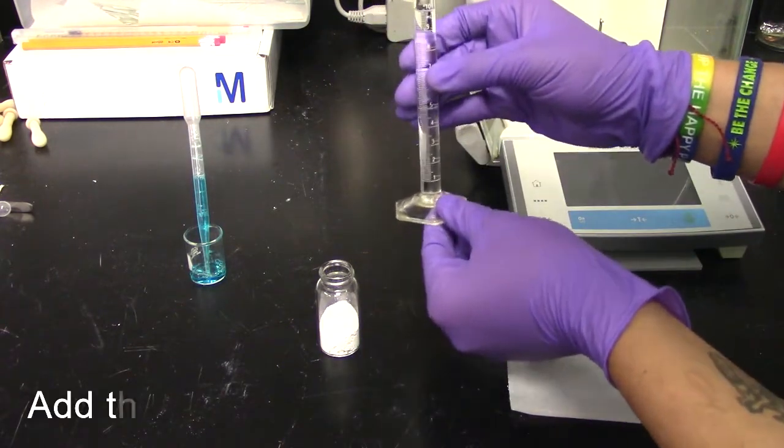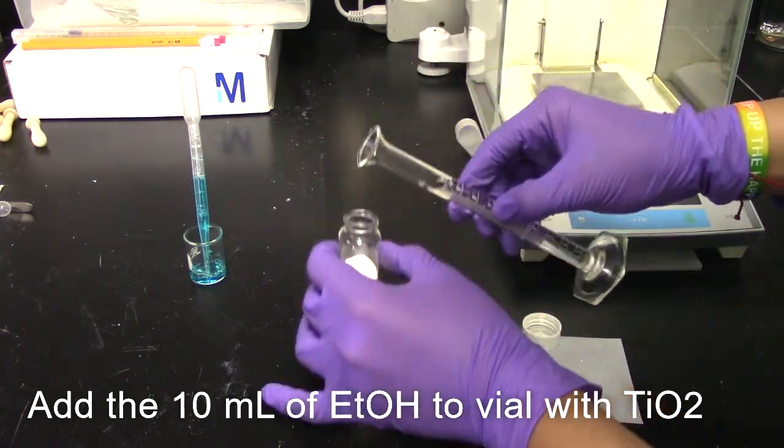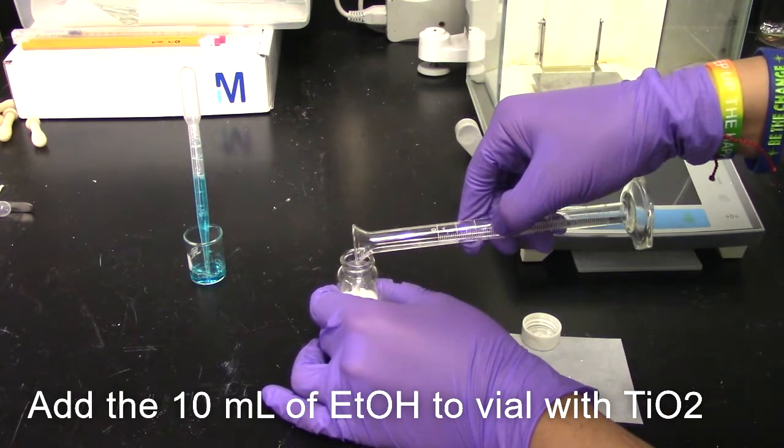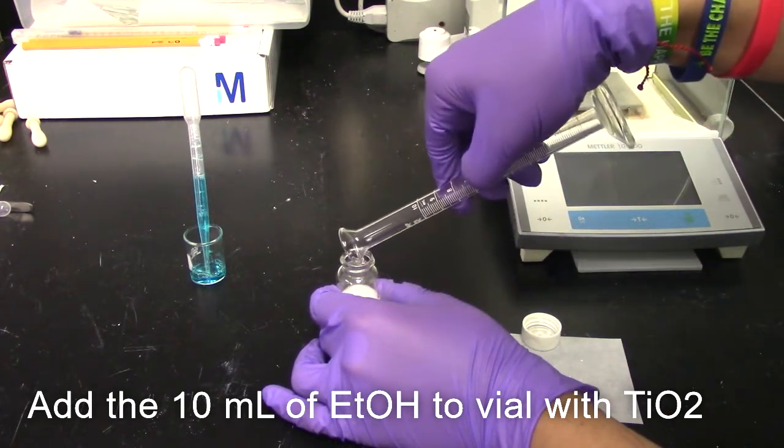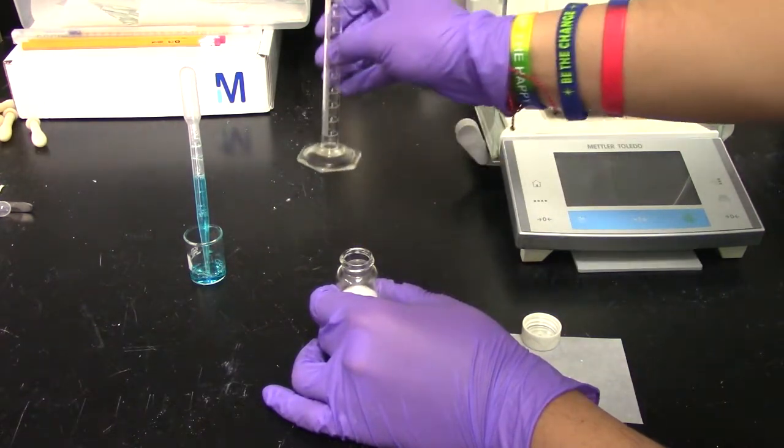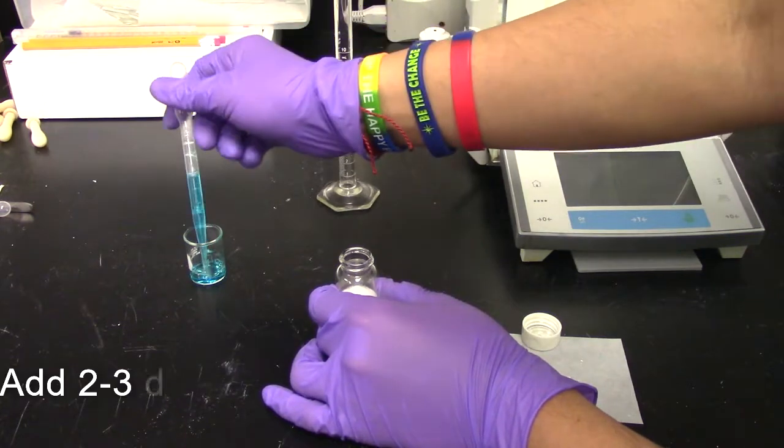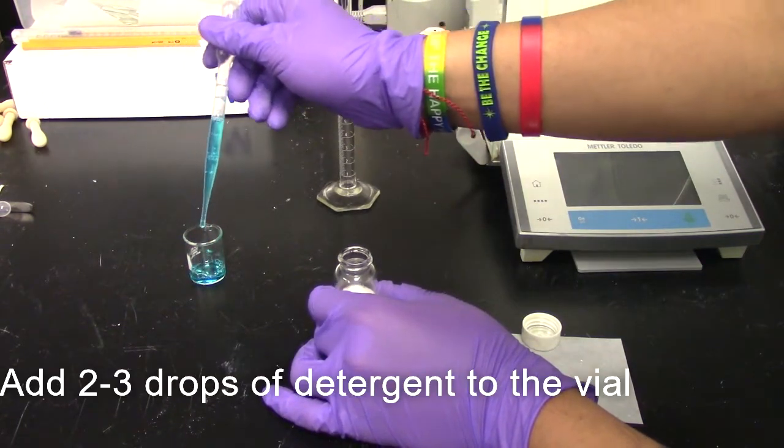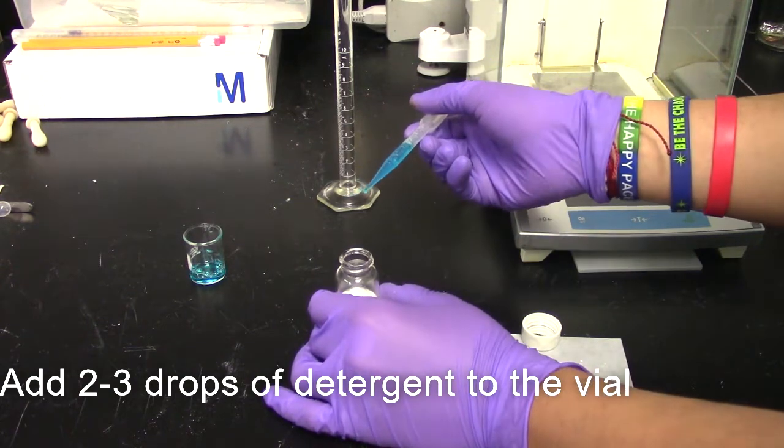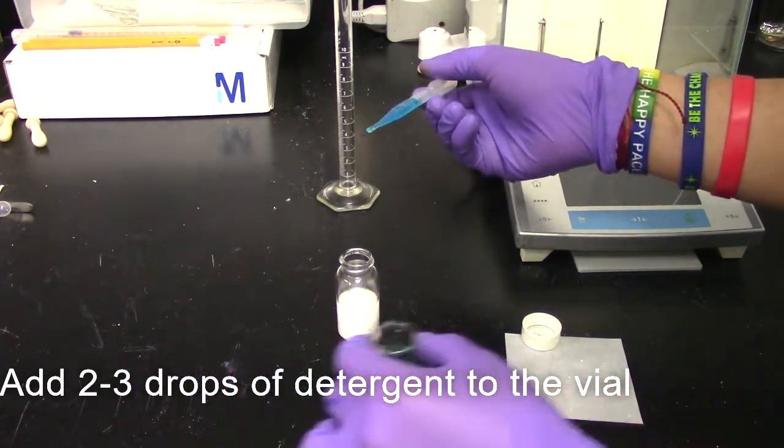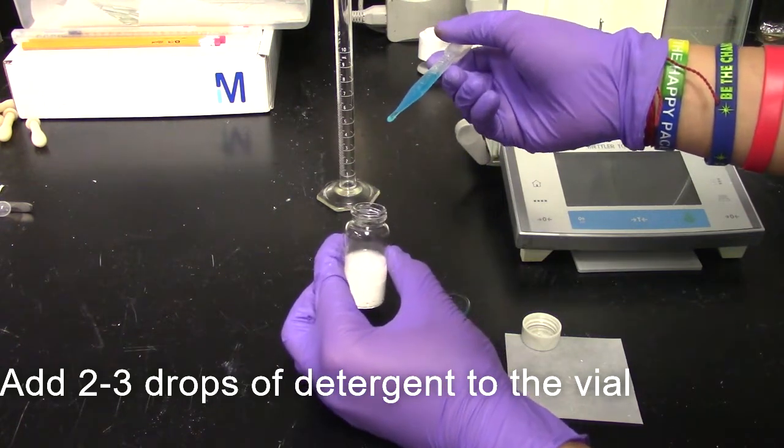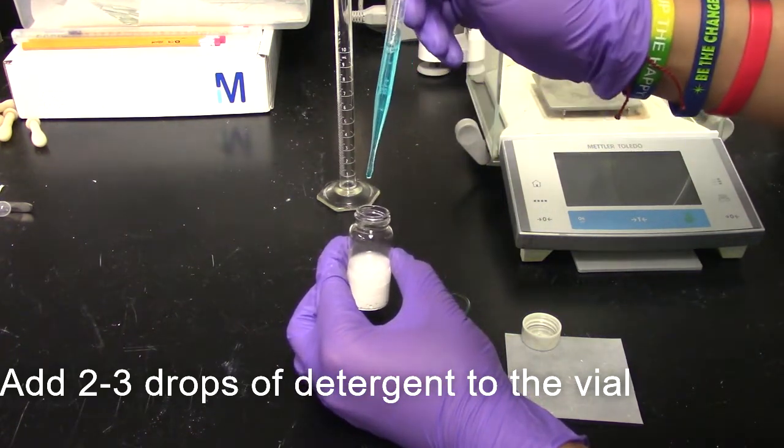Take the pre-measured 10 milliliters of ethanol and add it to the vial with the pre-weighed TiO2 powder. Add 2 to 3 drops of detergent to the vial with the TiO2 powder and ethanol. The detergent used in this video was simple Dawn dish detergent.